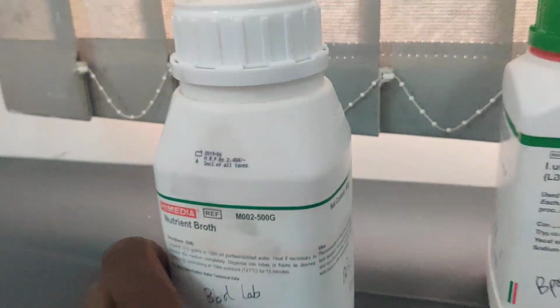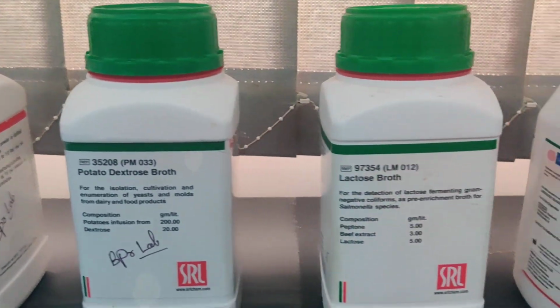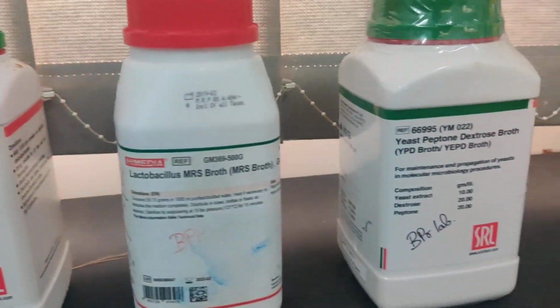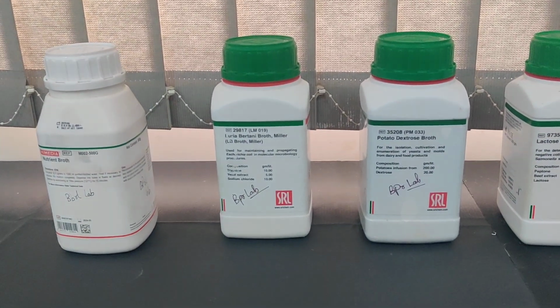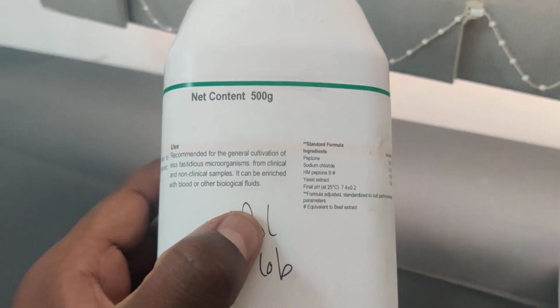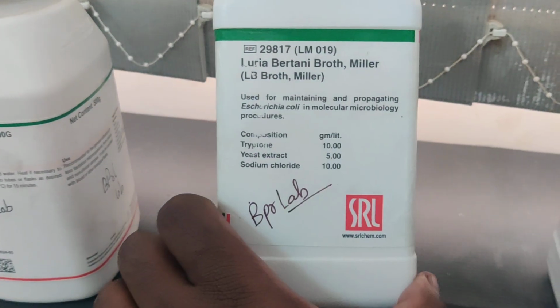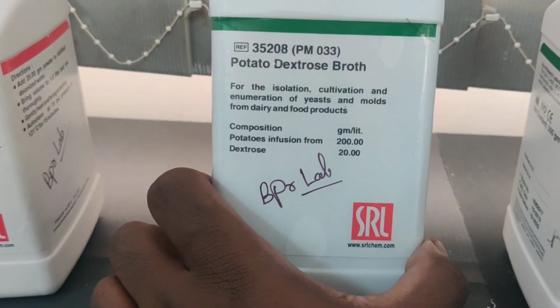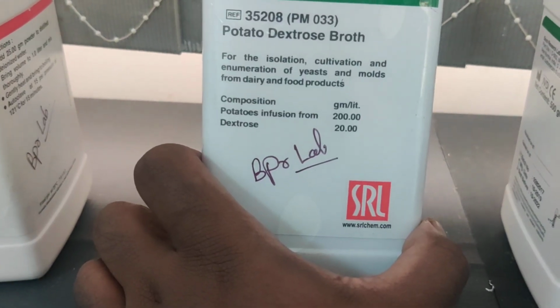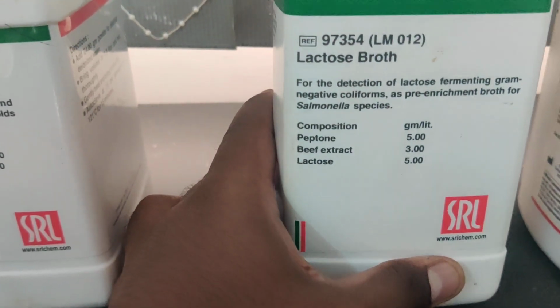The different forms that I am showing here, nutrient broth, LB, potato dextrose, lactose broth, MRS broth, and yeast extract broth, are all just for the growth of microorganisms, but they differ completely based on composition. Nutrient broth has one composition, and LB broth has a different one: rather than peptone, it has tryptone, yeast extract, and sodium chloride. Now potato dextrose has potato infusion and dextrose. And lactose broth has peptone, beef extract, and lactose.